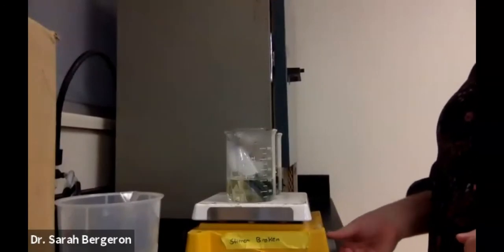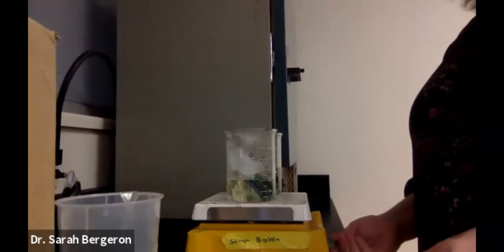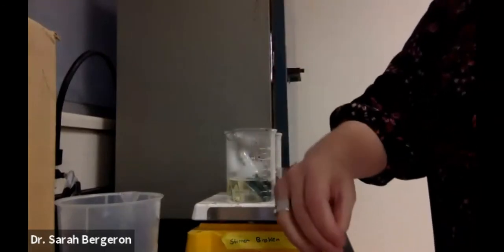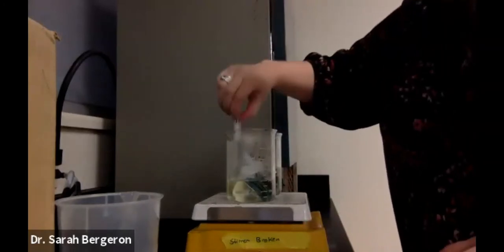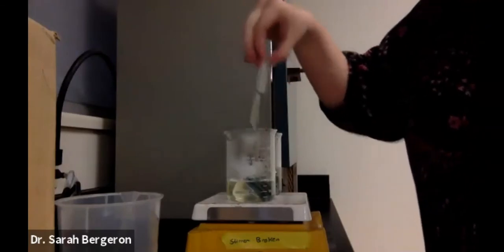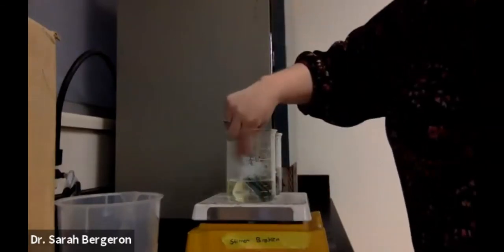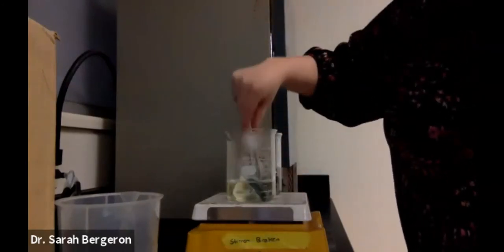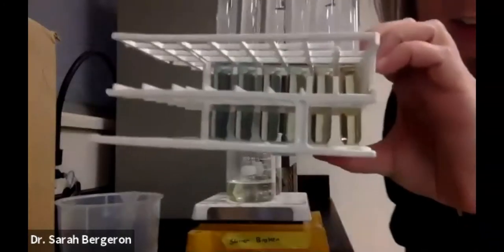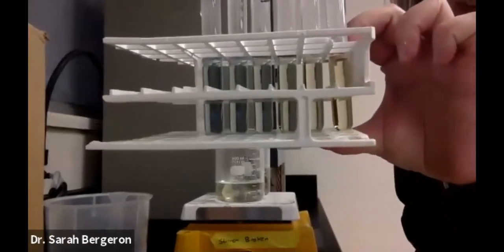So I'm going to turn this off. And what I'm going to do is you'll be able to see the color. Let's see. So that's our 0. Here's 1, 2, 3, 4, and 5. So what you should see, if I can see this, is a nice gradient. I don't know if you can tell, something white in the background, but you can see a gradient of color.